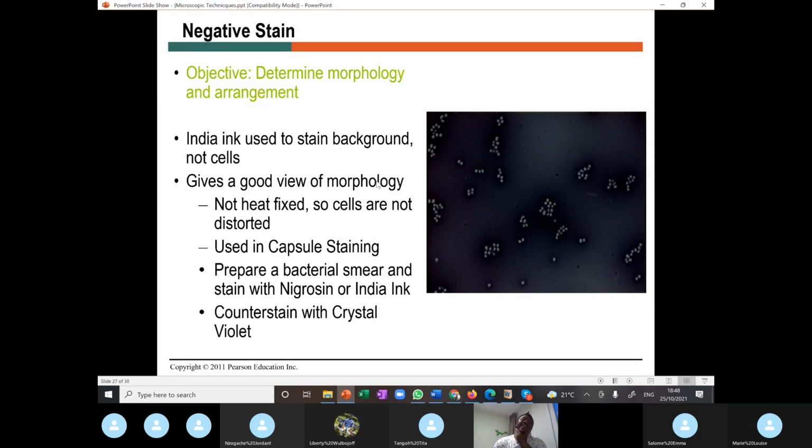I'll just talk also about negative staining. All this while we talked about the positive stain or the basic stain. Now let's talk about the acid stain. Remember, an acid stain is what? Negatively charged, and it will be repelled by the cell membranes, and therefore we're going to have a clear layer around our organism. Acid stains include Indian ink, nigrosin, and so on. Those are all acid stains, and they are particularly useful in confirming the presence of a capsule on bacteria.